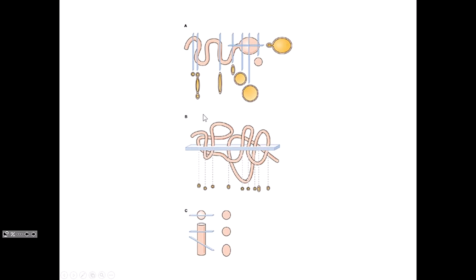So now, whenever you're looking at a section through tissue, you have to keep in mind that you're looking at a single plane through, a two-dimensional section, one plane through that tissue. So you could have a tube like this that's sliced at various locations, and you may see something like this and this and this, right? And you may think, well, this is a bunch of different tubes, but no, in fact, this is the one tube that has been sliced at different orientations. That might be a perfect cross-section, oblique section, longitudinal section. Keep that in mind when you're observing different structures.